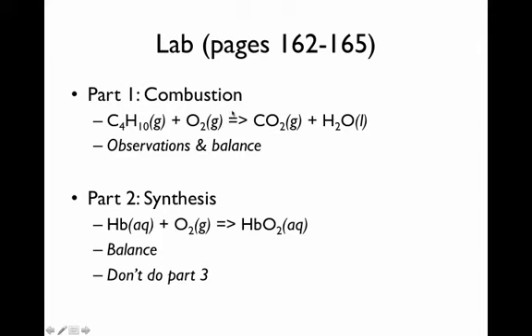There should be a triangle over this. It will be converted into carbon dioxide gas and liquid water. Your book says gaseous water. For the most part, it's going to be liquid. And the idea behind this is, observe what happens and balance the equation up here. So that's part 1. Part 2, you're going to do a synthesis reaction.